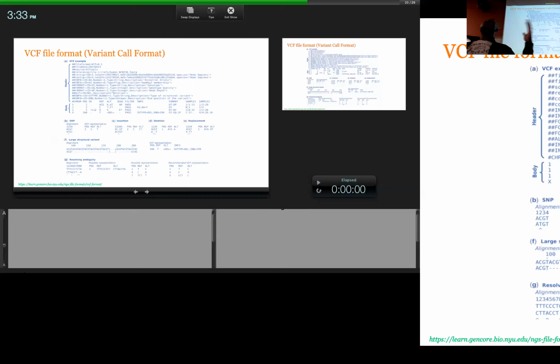Okay, so you're doing your alignments right now. The next thing you're going to do is what we've tagged pre-SNP calling. So you're going to generate a SAM file, convert it to a BAM file, and then index that BAM, and you're going to do a few multiple things that Ryan is going to go over, but as you're going through each of those processes, you're sometimes indexing your BAM, and sometimes you're sorting your BAM file.